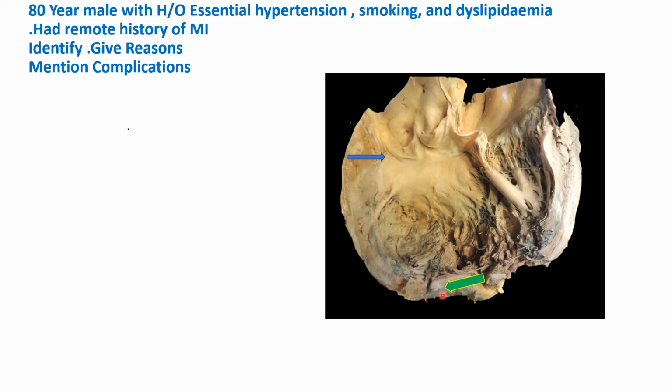And there is scarring seen. So thinning of the ventricular wall at the apex as well as on the interventricular septum side.